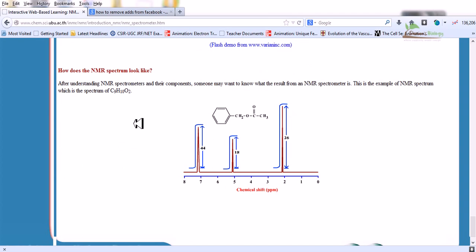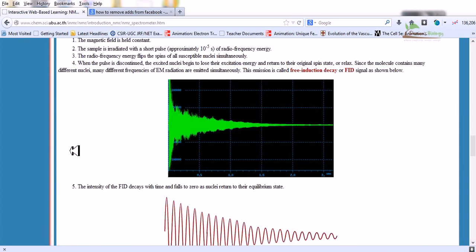How does the NMR spectrum look like? After understanding NMR spectrometers and their components, someone may want to know what the result from the NMR spectrometer is. This is the example of NMR spectrum, which is the spectrum of C9H10O2. As you can see here, their chemical shift occurs at different PPM concentrations. We can find the NMR spectrum at different levels.